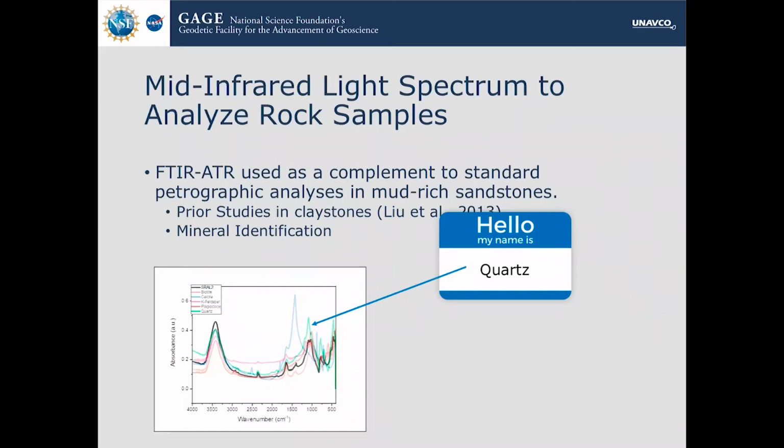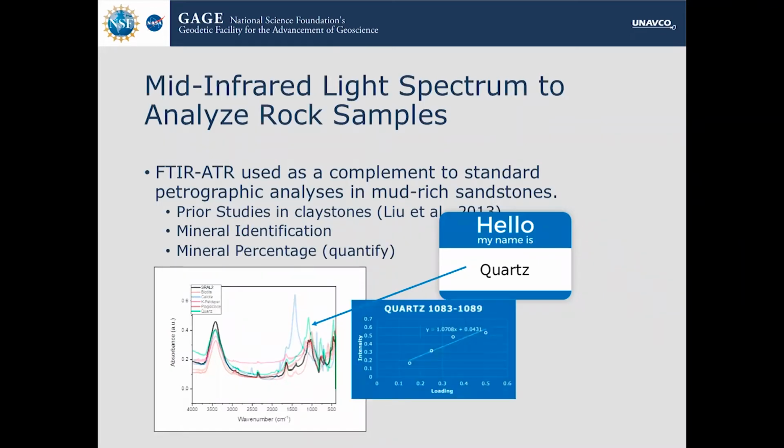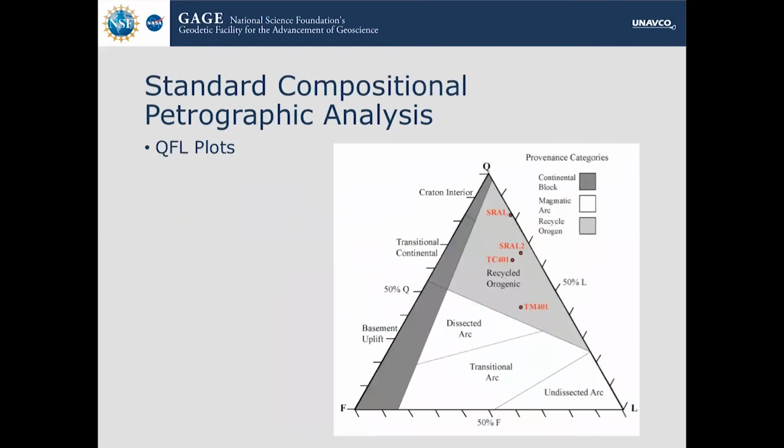So there is quartz in that sample, but also to quantify how much of the minerals are in that sample, because when you compare that to the QFL charts, that would offer some more insight, to see how accurate we are getting to the larger size grains in the sandstone compared to the ones that you can't see under thin section.